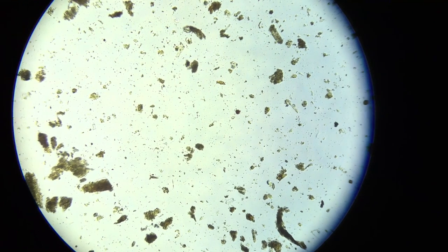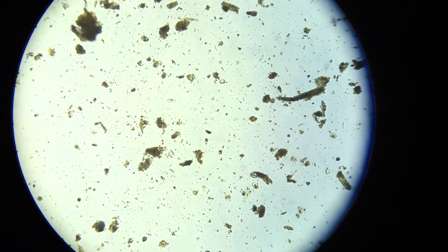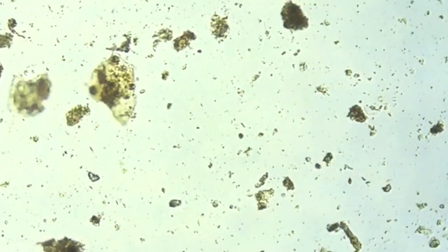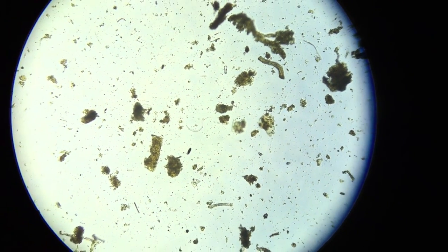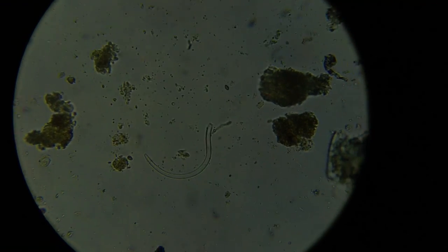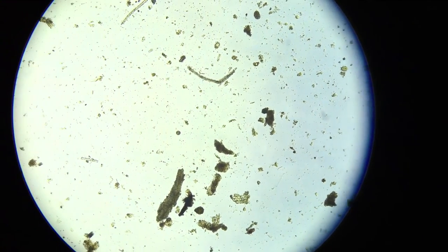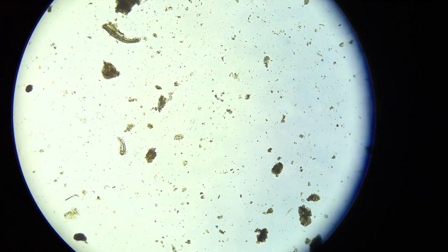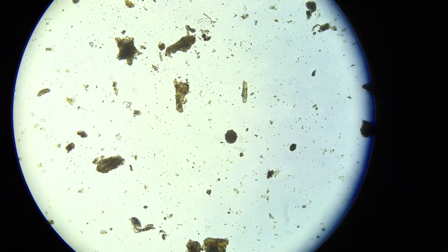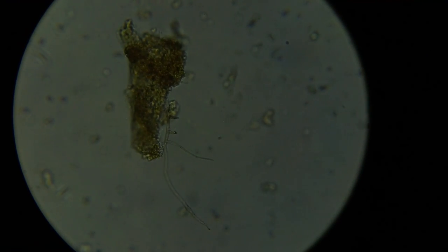Alright Bill, this is a quick flyover at 100x of your compost. That's a testate amoeba, not a nematode. At this magnification you can pretty much see fungi, but not very clearly — so you can find them and then get a closer look.